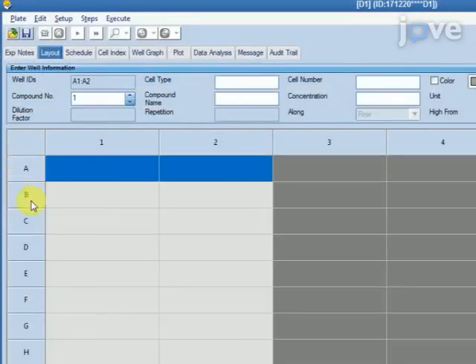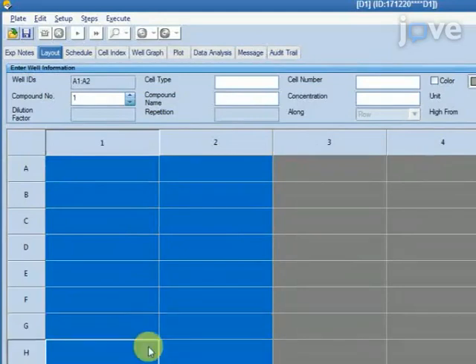On the layout page, select the corresponding wells that are included in the experiment and input the information such as cell type, number, and drug names in the edit boxes.